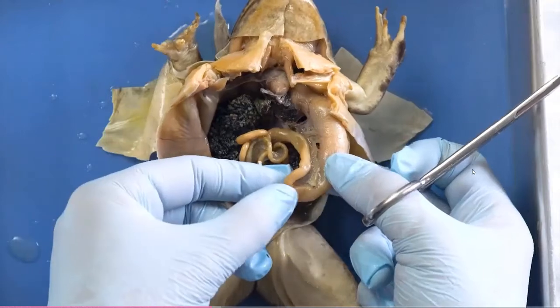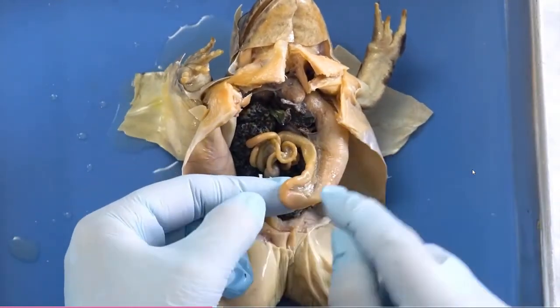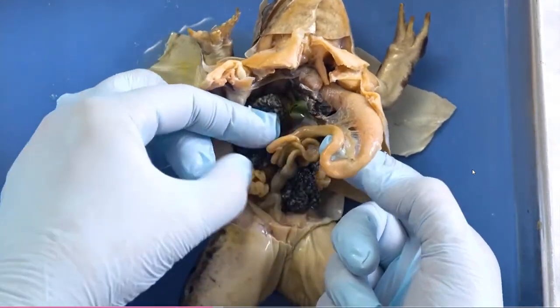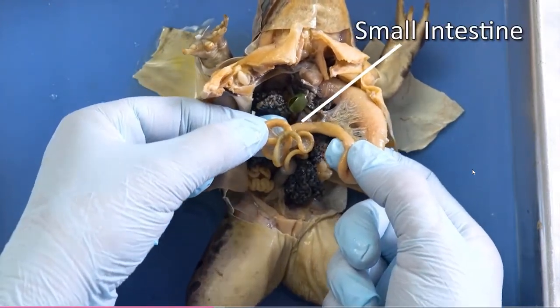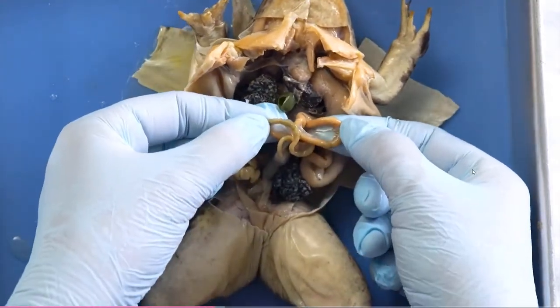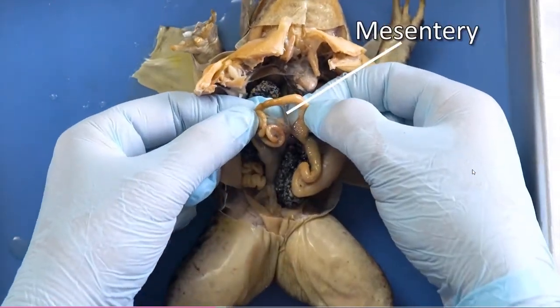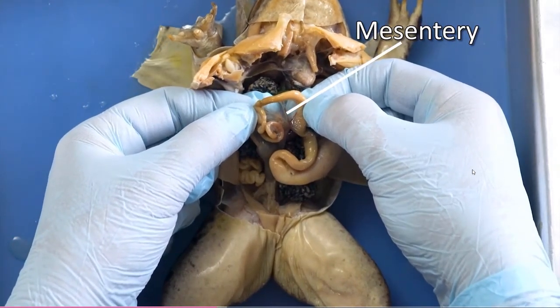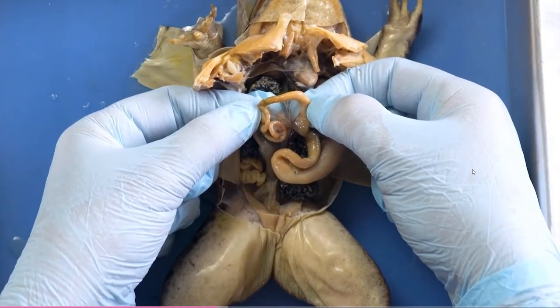As I follow this down, I'm going to see that lovely pancreas again. And as I come up here, I'm going to notice that this changes in size, diameter, and texture. This is going to be the small intestine. And as I pull this up, I'm going to see that it's coiled and also that it's attached with this type of almost a saran wrap material. This is the mesentery. If I look closely, and especially if I had an injected frog, I would notice that these are blood vessels.